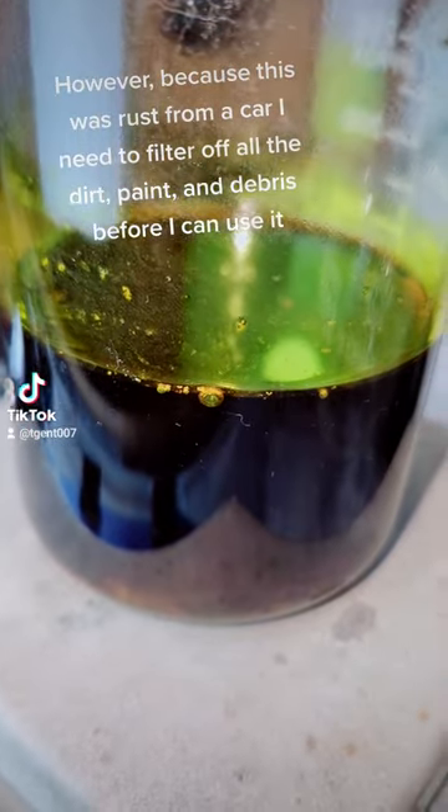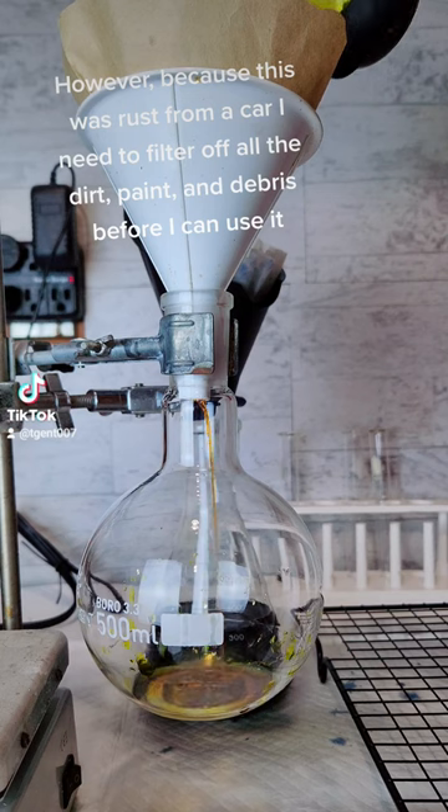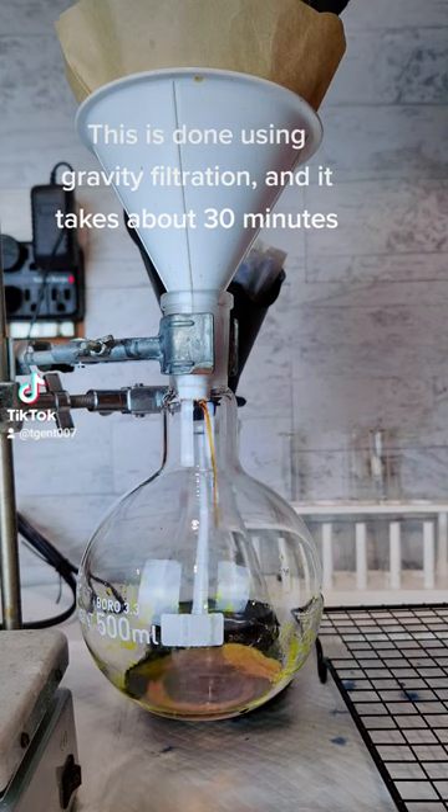However, because this was rust from a car I need to filter off all the dirt, paint, and debris before I can use it. This is done using gravity filtration and it takes about 30 minutes.